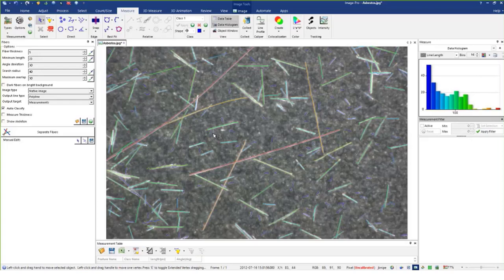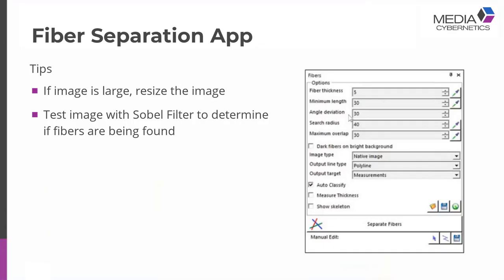One important thing within this interface: I can always draw a polyline by hand — if I miss a fiber, I can draw it on manually. Let me go back to the presentation for a couple of important points.